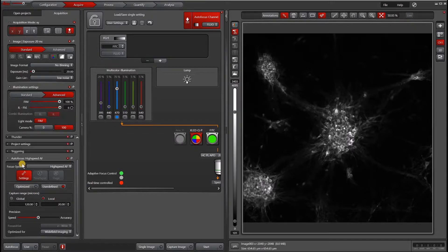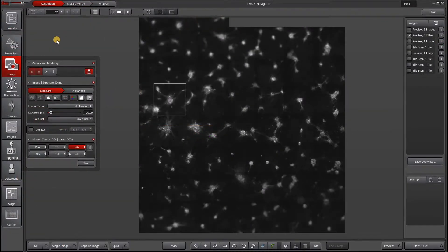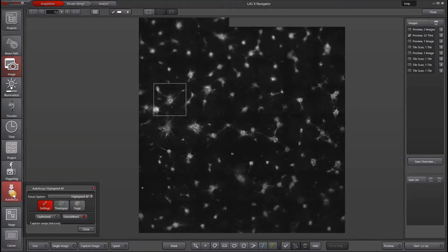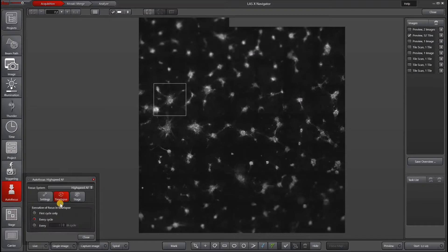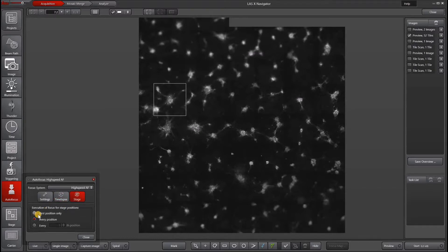Now let's see how autofocus works in Navigator or when we add time-lapse. There are two additional buttons on the autofocus channel that are available to you. One is time-lapse and the other is stage. If you click T to add time-lapse, you can go to the autofocus panel and click the time-lapse and you can then choose to do an autofocus for only the first cycle, every cycle, or every nth cycle. Similarly, if you go to stage, you also have the option of running an autofocus on the first position only, every position, or every nth position.